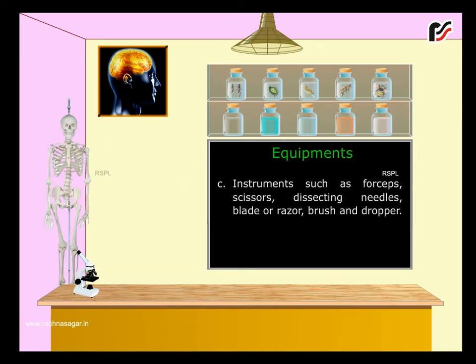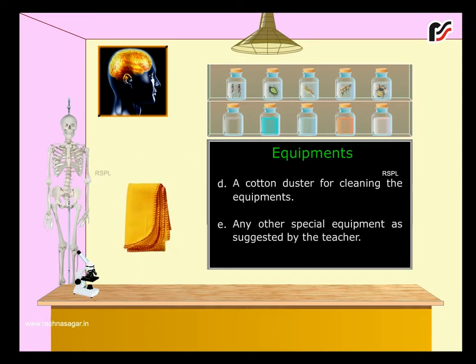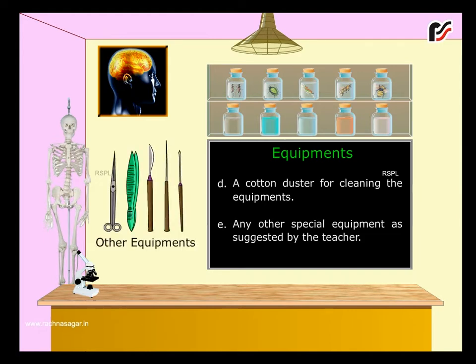Instruments such as forceps, scissors, dissecting needles, blade or razor, brush, and dropper. A cotton duster for cleaning the equipments. Any other special equipment as suggested by the teacher.